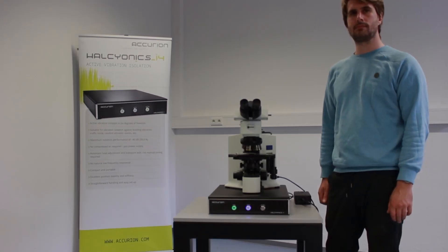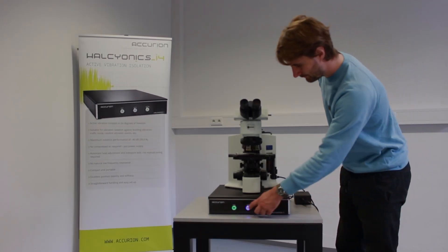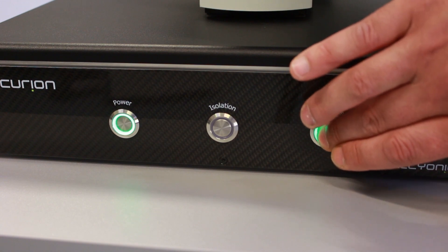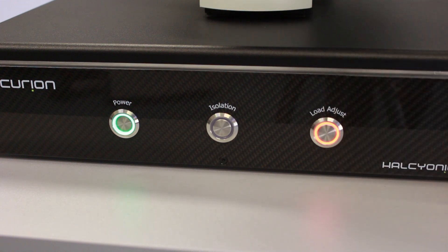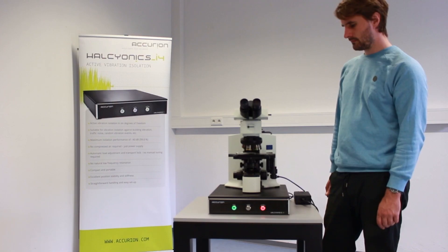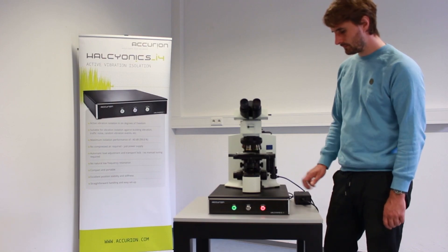For transportation purposes, the i4 system has to be locked. Press and hold the load adjust button for approximately 4 seconds until the LED turns red. The process is completed when the motor stops and the top plate is not movable anymore but properly locked.